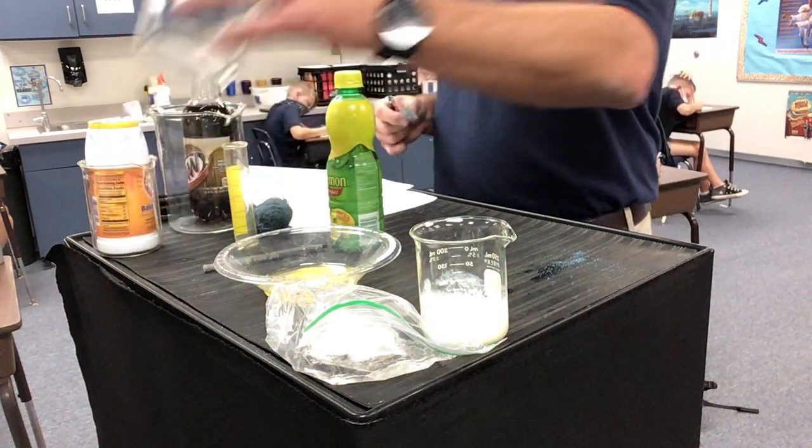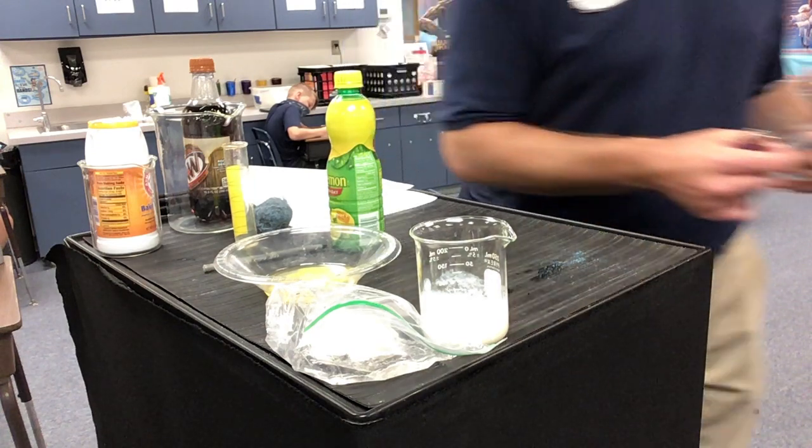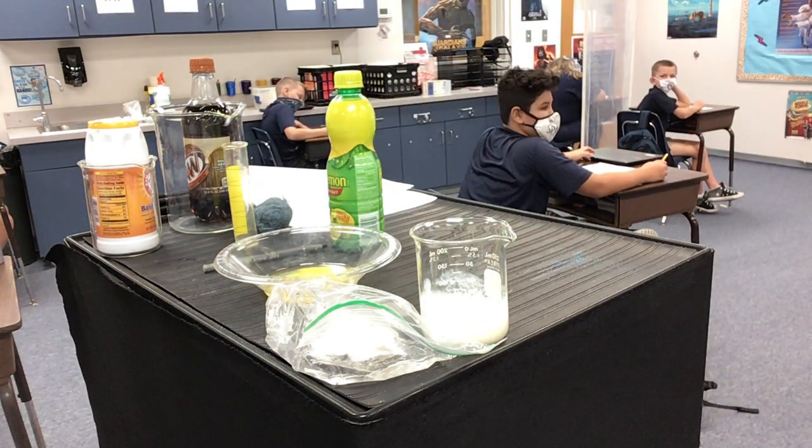All right, I'm going to go outside and do this one. I'm going to go out and light it on fire. I'll let you see what it looks like when it's done.